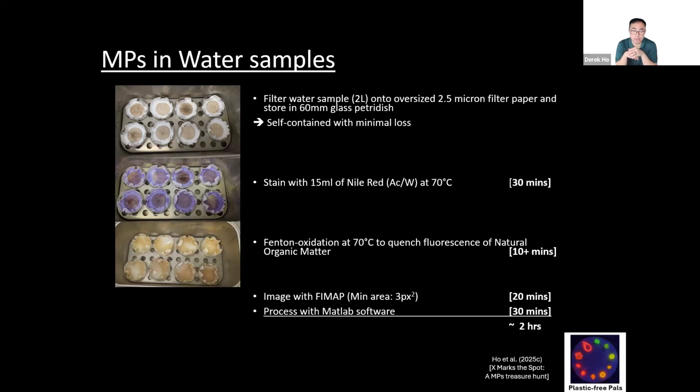can digest even the filter paper and must be done very carefully. We then image it with FIMAP and then process it with the MATLAB software. And this takes us about 2 hours in total.